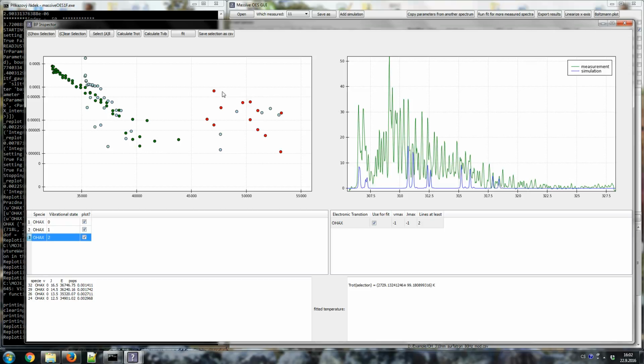You see that this doesn't make a very straight line, so I can just clear selection and select these points and see how much I can trust them if I compare them to the measurement. So I will just show selection, and I see that these are these very very small lines. Basically my decision is don't trust that too much, because it's really trying to compare these small things on these big lines. So this helps you to select the points that really make sense.